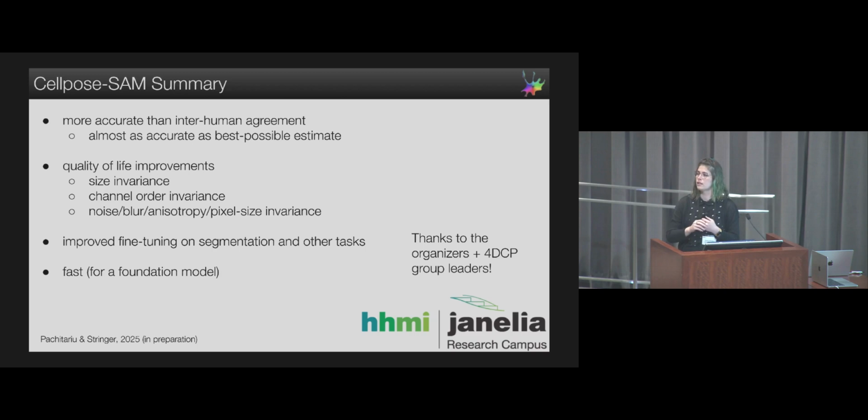Okay, but for the patch size, do you compare different levels? Like, do they perform differently? We've tried 4x4 and 16x16, and 8x8 we find works the best. That we've tried. But it's a good question.